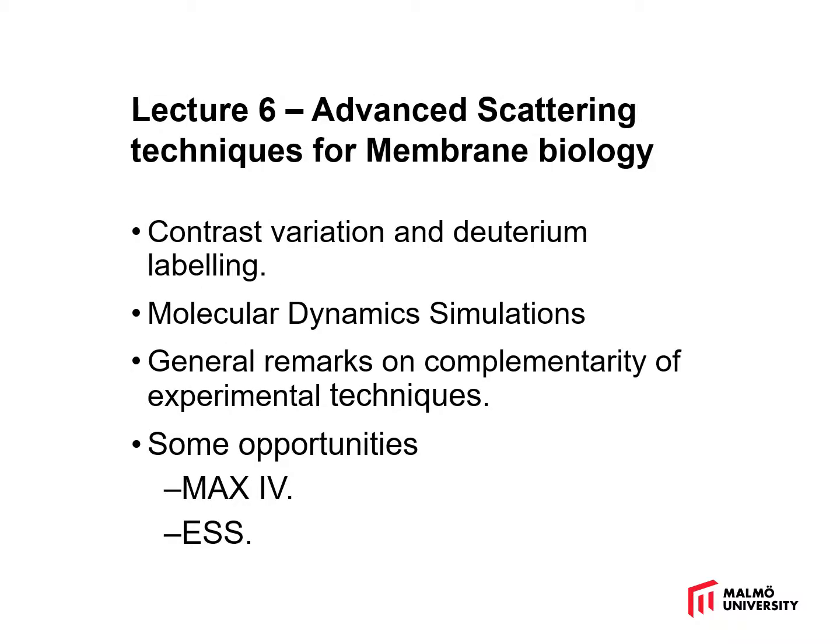I've called Lecture 6 Advanced Scattering Techniques for Membrane Biology. It's basically all those things that I thought I should talk about that hadn't already been covered, but were nonetheless important. So I'll expand on the concept of contrast variation, and in particular deuterium labelling, which is really quite important for biological and membrane biology samples. I think it's also useful to think about the role of MD simulations in analysing scattering data and the complementarity of the two approaches, that is molecular dynamics and small angle scattering.